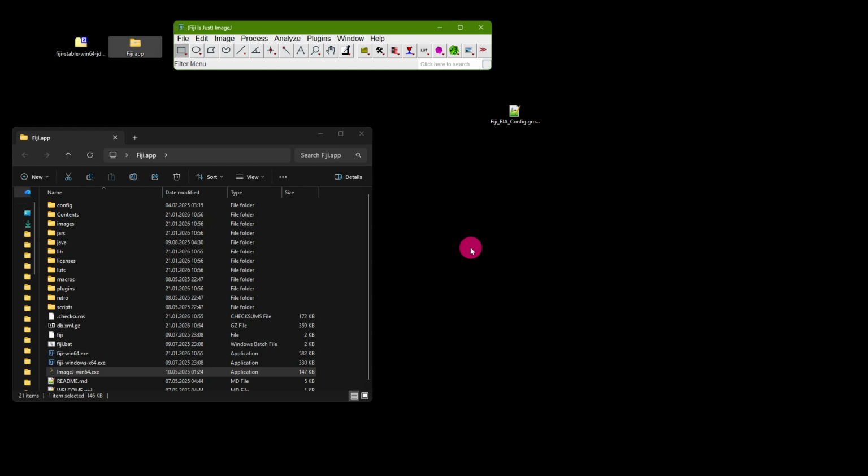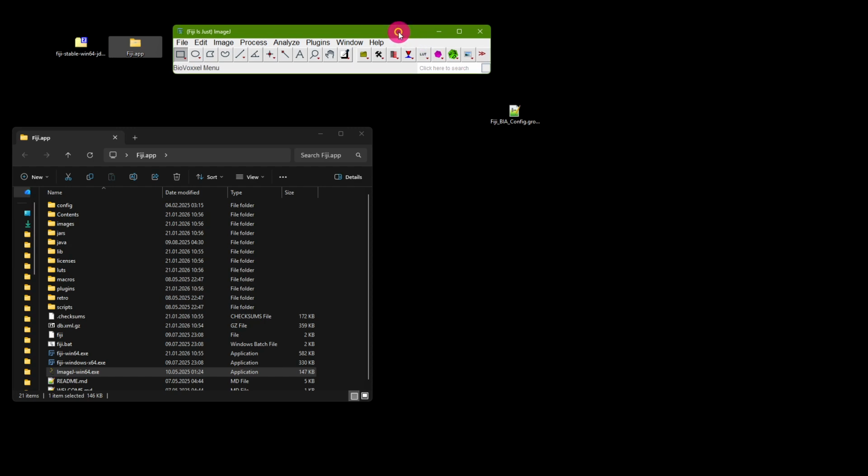Best is if you install it on your own personal laptop and potentially in any other Wi-Fi like at home, where you can be relatively sure that this installation process works. If you do not see these colored icons, then please repeat the configuration process. In the worst case, try to unpack Fiji in a different location and try to repeat that process that you have seen in this video again. And if there are any further problems, then please do not hesitate to contact me by email so that we can fix this before we start the workshop.